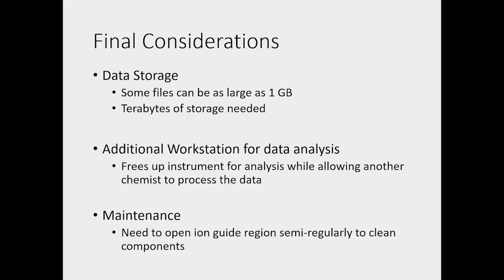Before we go to questions, I'm going to add into the maintenance. I believe this is all newer instruments, so I don't think it's just ours, but there is an isolation valve in between the ion guide region and the time of flight analyzer. So when we take down the ion guide region to clean it, we don't have to vent the entire instrument. The time of flight is able to stay at the higher vacuum, so that maintenance is really pretty quick. We probably get it done in less than an afternoon, including retuning when we bring it back up. It's pretty quick, so I just wanted to include that. That's really a nice feature.